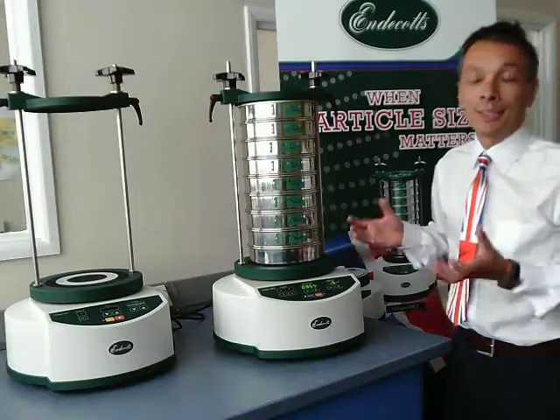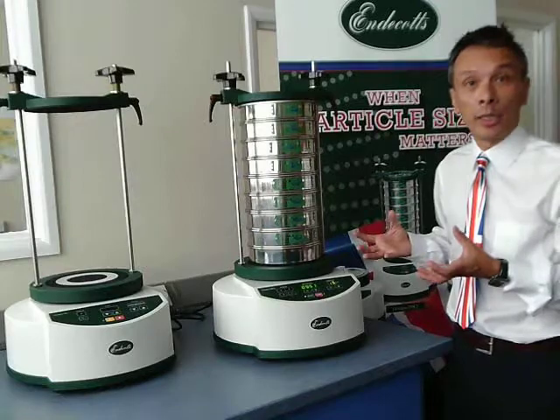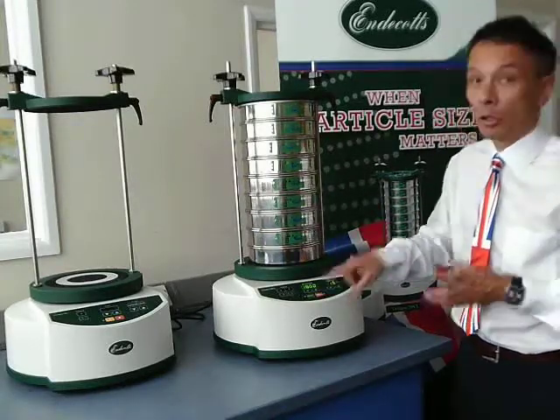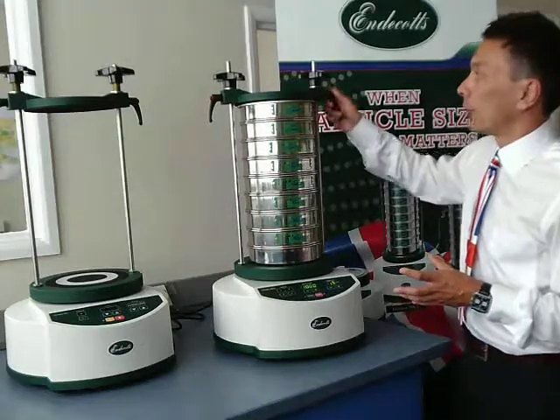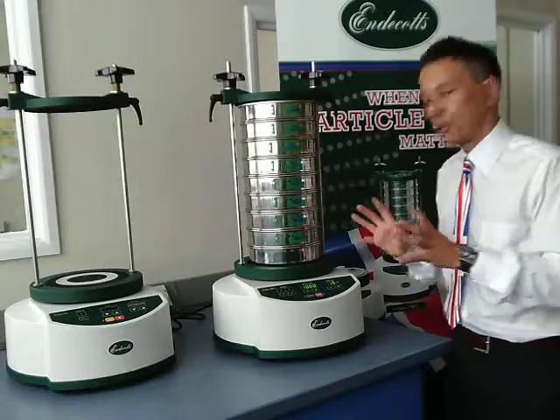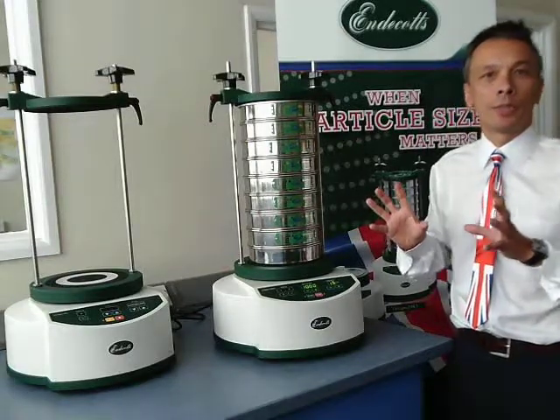It's electromagnetic, so you can hear it's actually very quiet. It also retains some of the features of our old machine, namely the clamp plate mechanism. However, the rest of the machine is completely new.